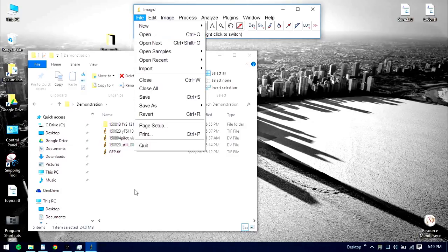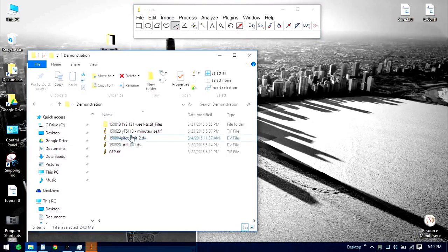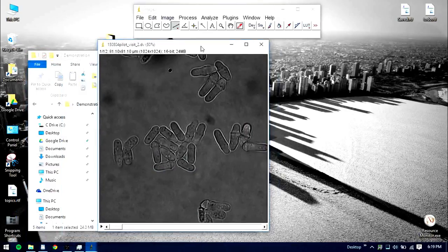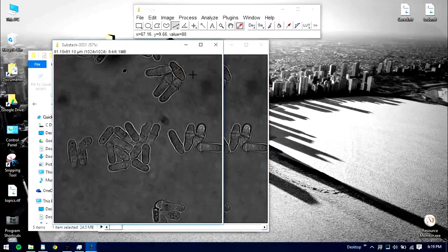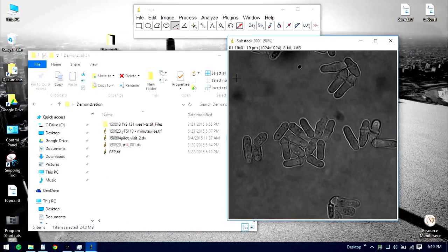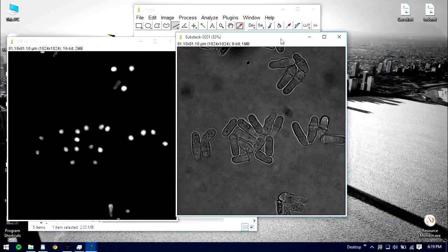So I'll open this up again. Oh, I already have this open, so I'll just open the GFP slide.